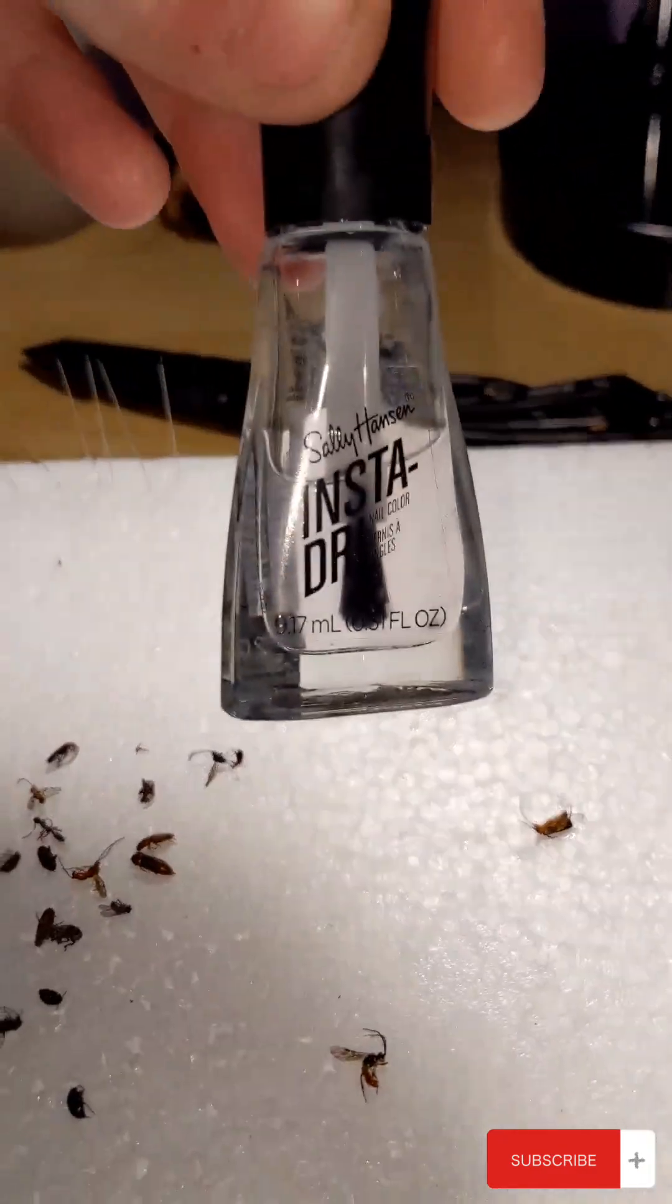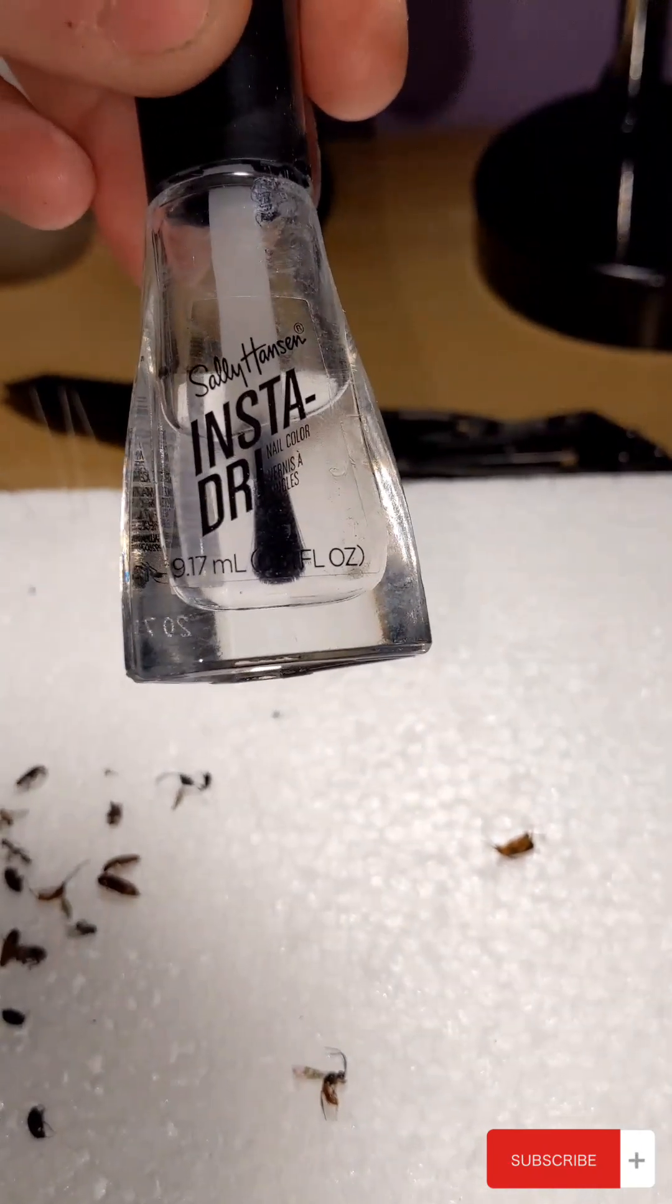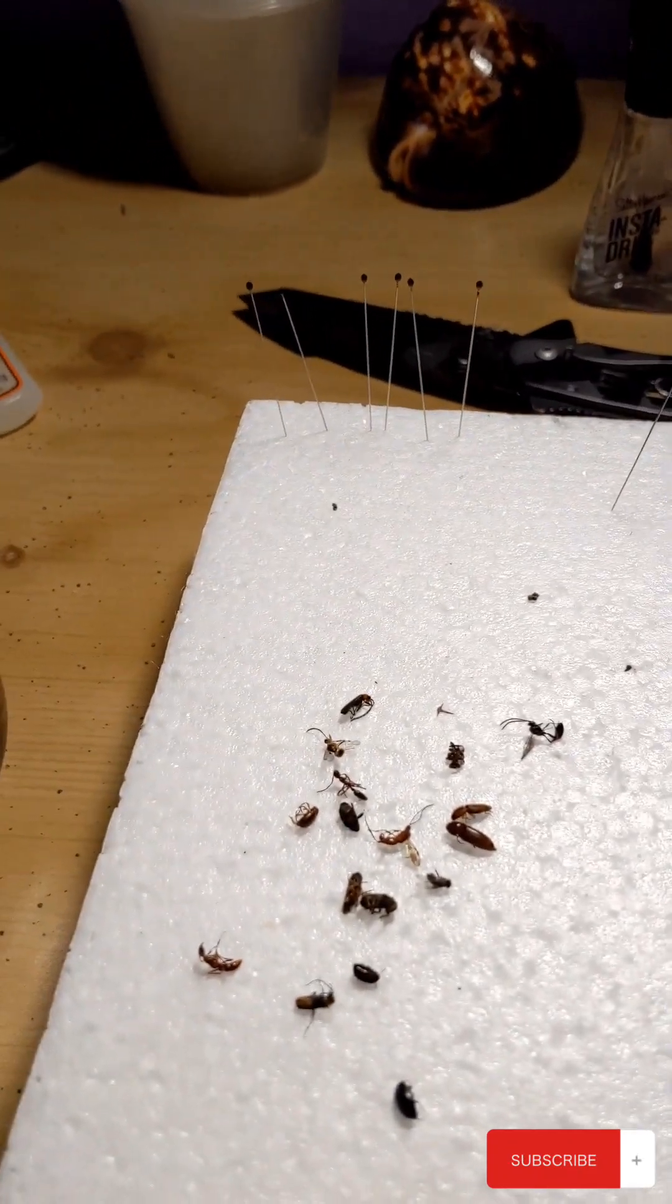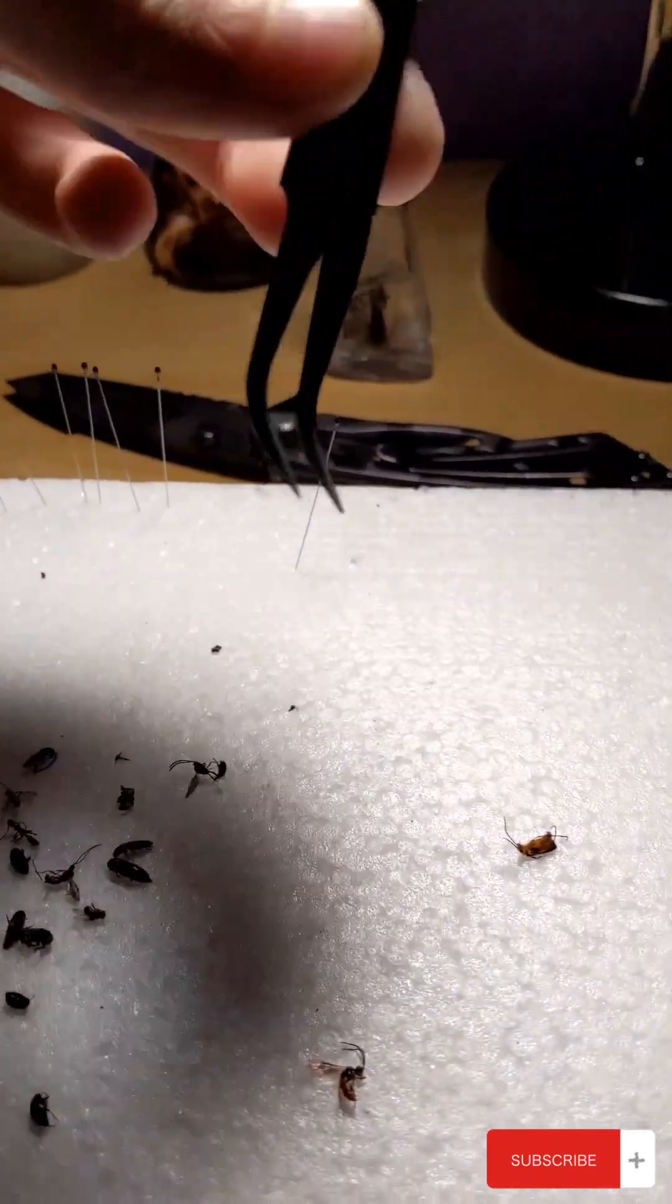You're going to need some glue or, in this case, clear nail polish which is pretty inexpensive. And then your forceps right here.